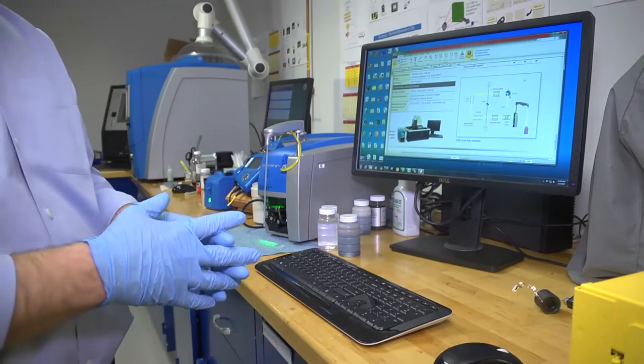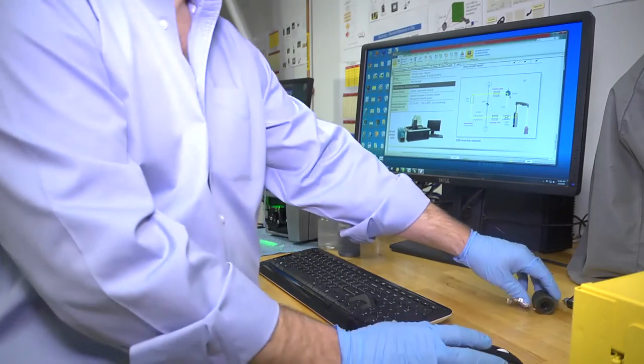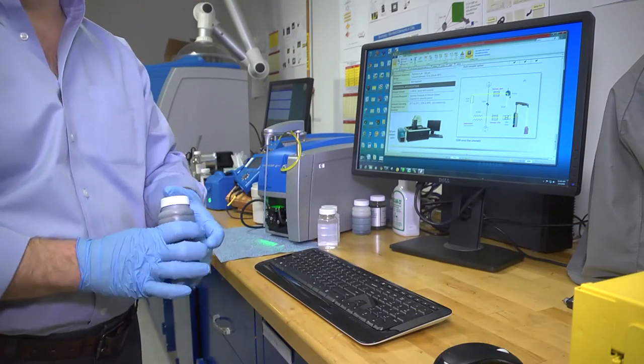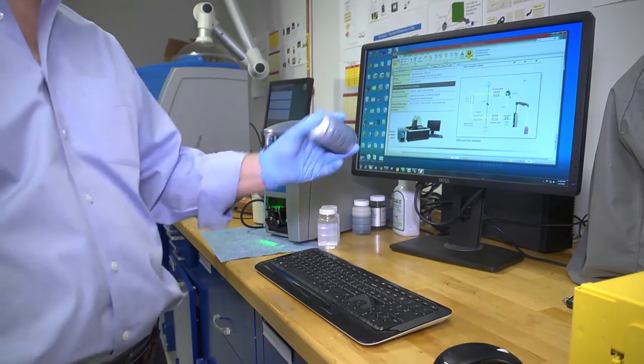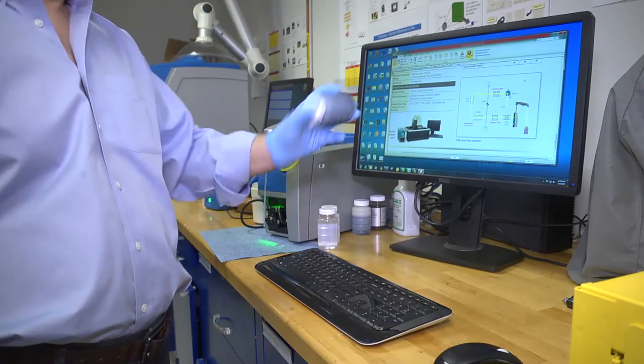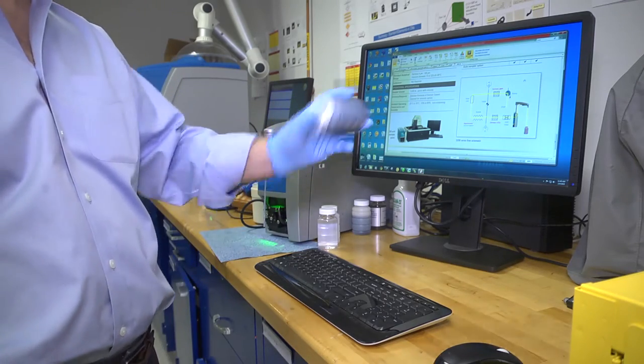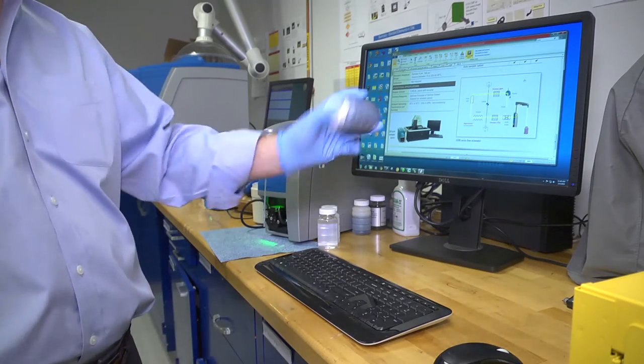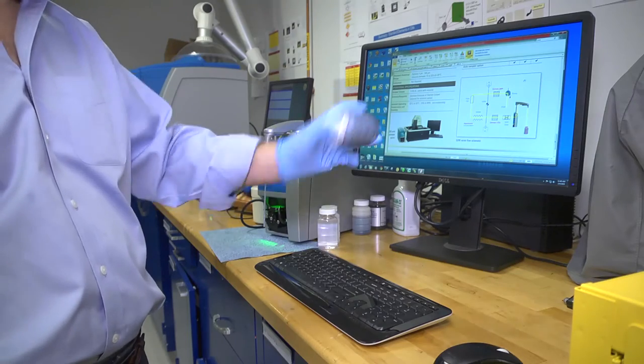Let me proceed to how you operate and measure a sample. As with any particle counter, sample preparation is an important part. It's recommended that you agitate the sample for 30 seconds. This can, of course, be automated with a laboratory shaker.